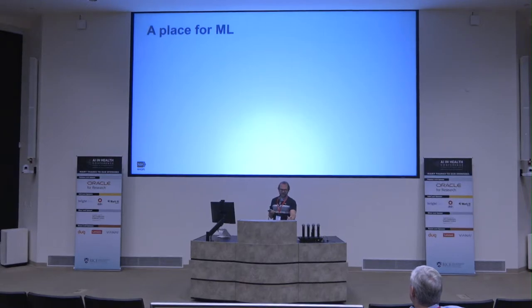So I want to finish because the conference is kind of machine learning focused. There's obviously a lot of machine learning applications here. Obviously, all the sequencing tools that I talk about, like PacBio and Nanopore, rely on machine learning to output the sequences, right? That's how you convert those squiggles into base pairs.